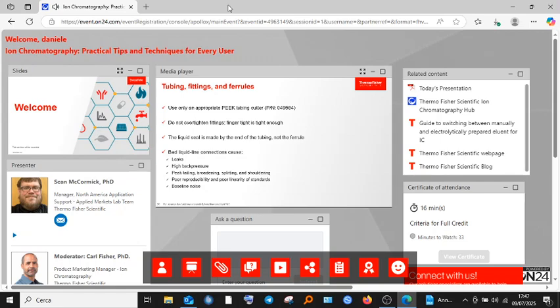If you over tighten a fitting that's made of plastic, it will distort the end and not allow it to seat properly. And last but not least, the liquid seal is made by the end of the tubing, not the ferrule itself. So a good clean cut on the end that's flat will sit better in the fitting and therefore make a cleaner connection. If we follow these tips, we should avoid a lot of the bad liquid line connection phenomenons that people observe in their data.